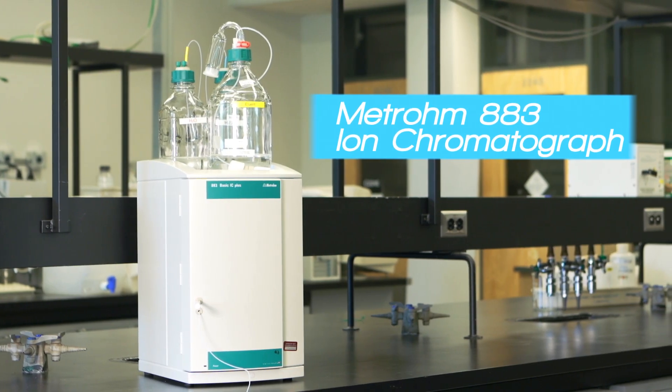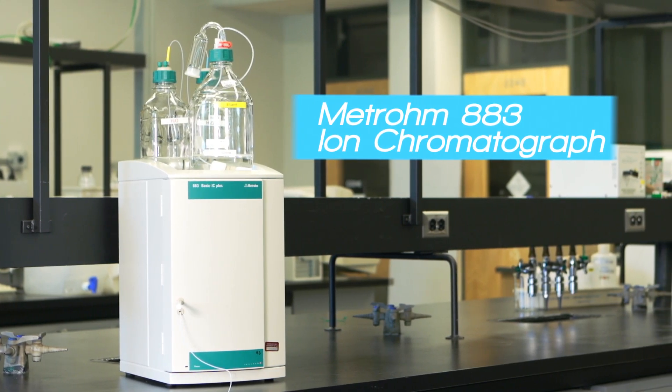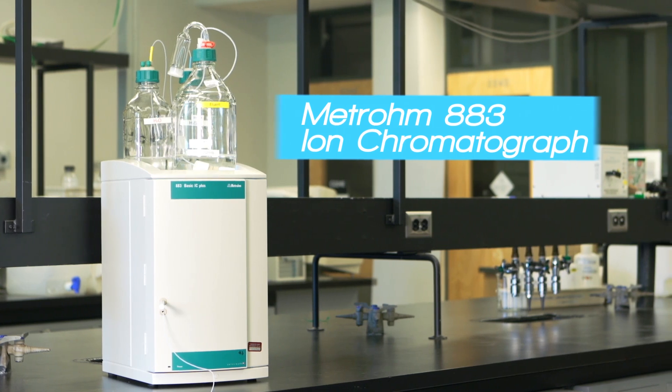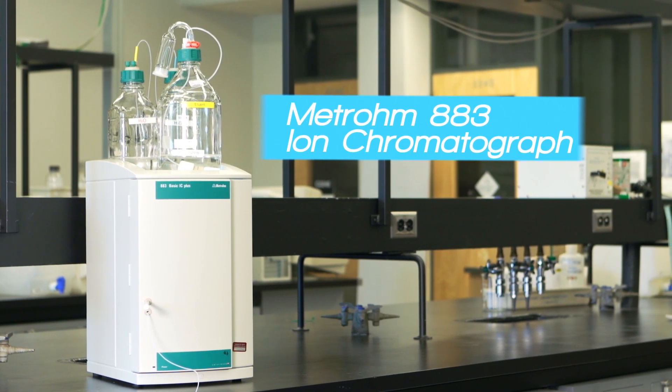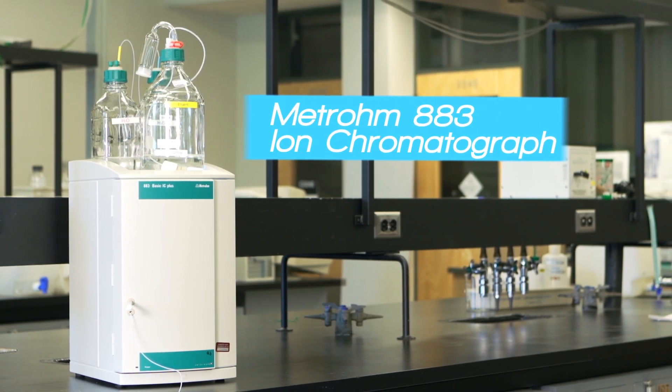The instrument that we're looking at today is the Metrohm 883 ion chromatograph that we have set up for anion analysis. What we see today can be generally applied to other ion chromatograph systems.